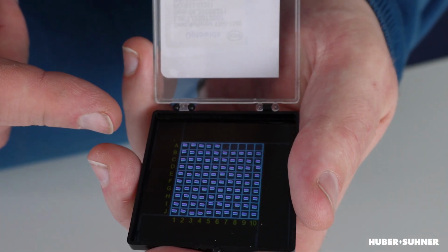We are using micro-optical components like these thin film filters. And of course, we want to characterize the geometry of such little tiny pieces. And that's not that easy. You can't use standard microscopy or things like that. And if you want to find out how we do it, just stick around and we'll check it out.